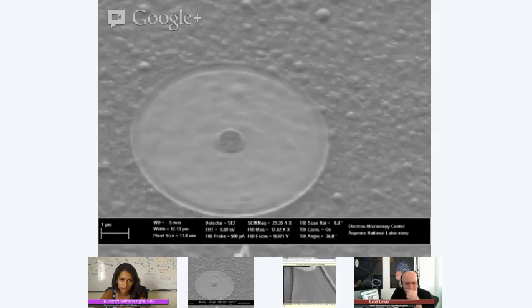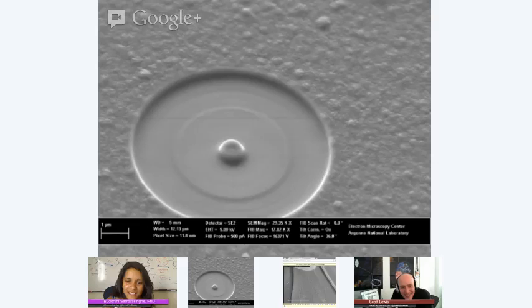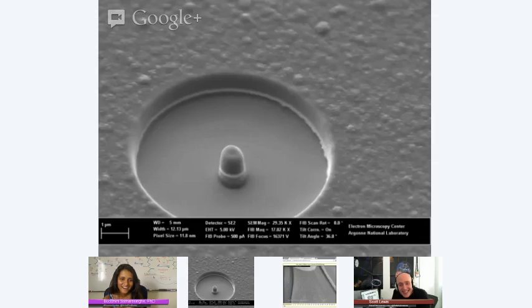Can you see this? Yes. What is that? So that micron marker on the left is 1 micron. This is a UNCD film, the ultra nanocrystalline diamond film, and I'm making a little pillar. Now you'll see a seed layer of tungsten come up, and then silicon. I am removing material like a potter on a potting wheel, but I'm using the ion beam to remove it. I'll play it again for you.